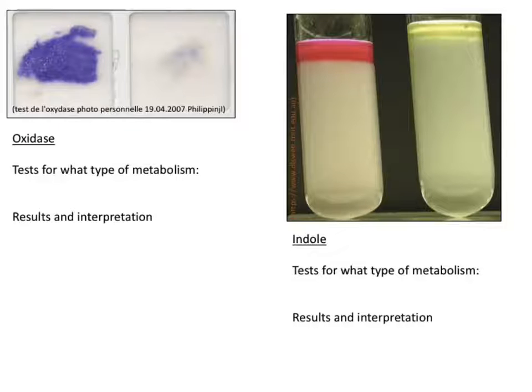So, what I'm going to have you guys start out with is just for each of these different tests, I've listed what they are. The first one is a lactose phenol red, second is methyl red, third is oxidase, fourth is indole. Front and back of these sheets.